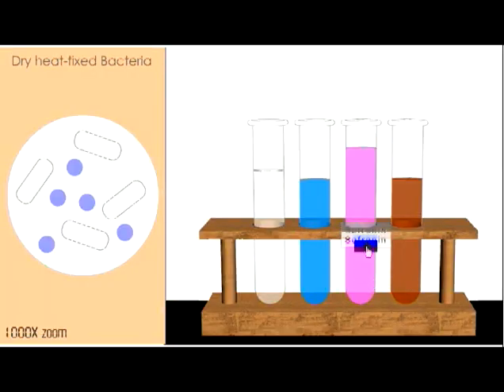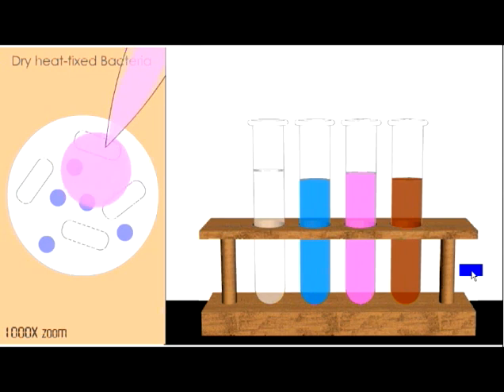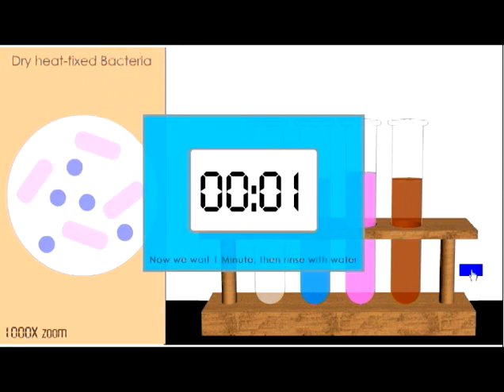So the final step is to add the counterstain safranin, which you can see is a pink or a reddish color. We'll do that, and as in our other staining steps, we're going to need to wait a minute.